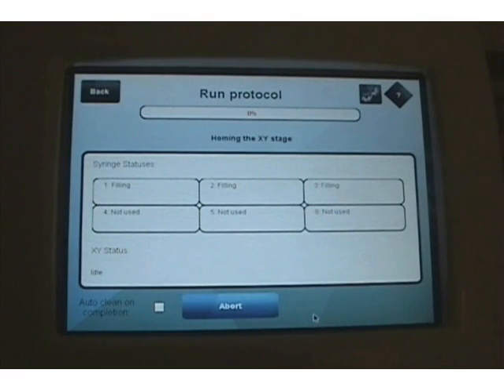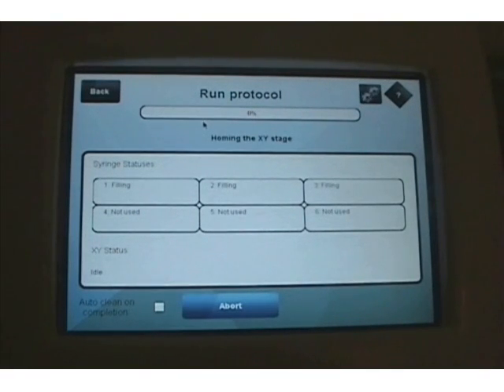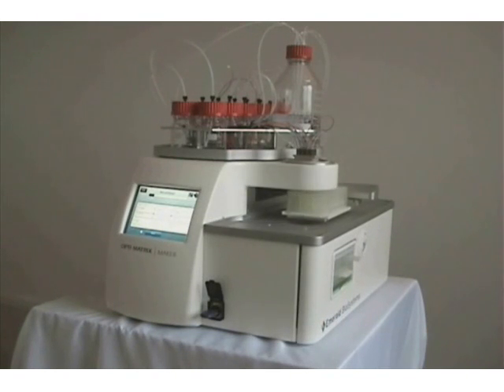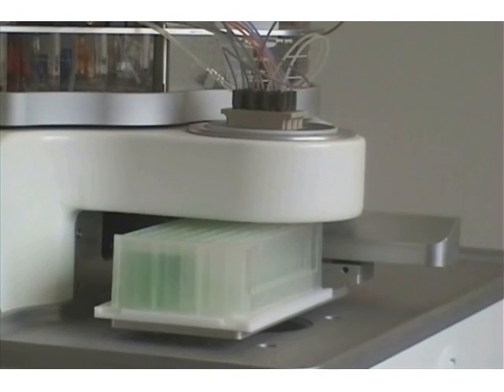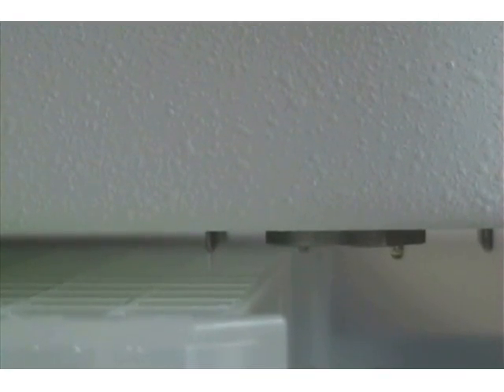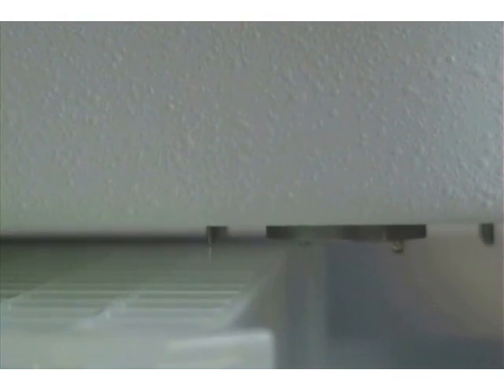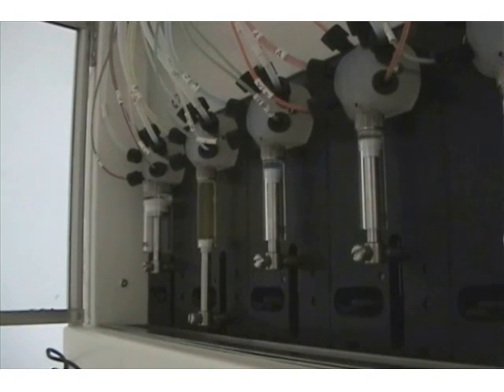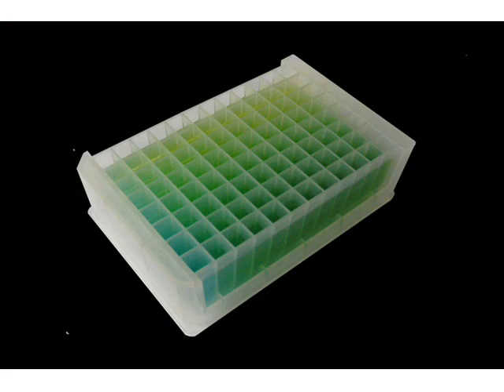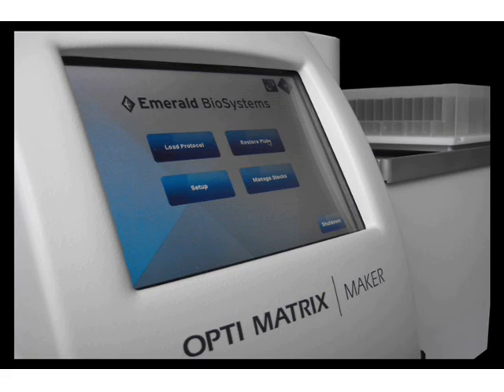That's all there is to it. The screen provides a constant update throughout production to let you know what each of the syringes are doing and what action is taking place, including a bar at the top indicating how much of the screen has been produced as a percentage. It also provides a box to click in the lower left corner to automatically clean the instrument when it completes the run. From this point on, the OptiMatrixMaker takes care of everything — you can move on to your other work around the lab. Total time depends on target volume, number of conditions produced, and number of stocks used in each well. One syringe fills while the other pumps, so there is never any downtime. Here is the finished product: a complete optimization screen ready for crystallization experiments, and it took only a matter of minutes from initial design to completed production.